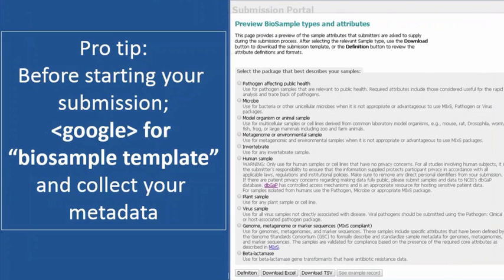After submitting a BioProject — which is sort of like the specific aim for a grant — a whole bunch of things can go under there, such as sequencing data, biological metadata submitted through BioSample, as well as links to other types of data that you might have DOIs for. The next thing you would do is create a BioSample, which you also do with the other submission pipelines we discussed. One thing I suggest to all submitters is to Google for 'biosample template,' select the template that's appropriate for you, and look at what biological metadata you need to collect before starting your submission.